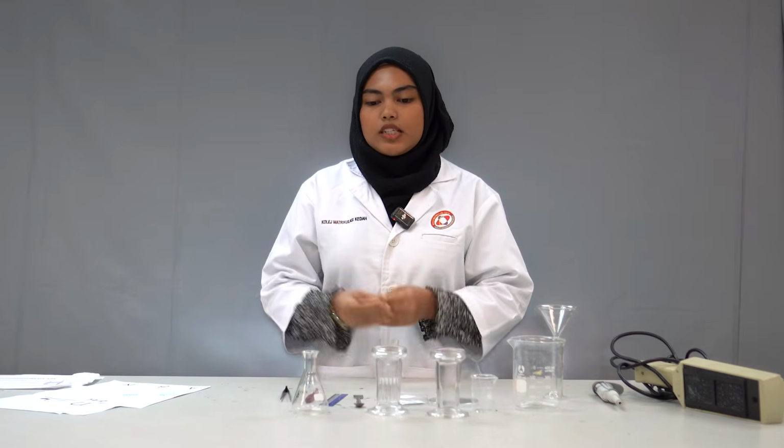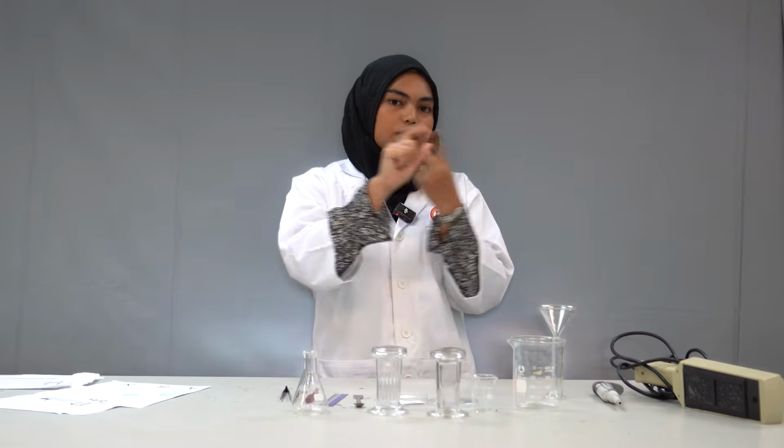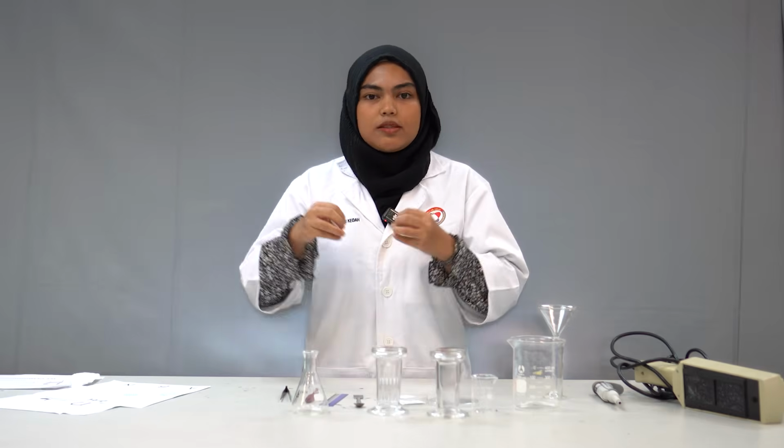Okay, next I will talk about the industrial applications of the TLC experiment. There are three largest fields that use TLC, which are clinical, pharmaceutical, and food testing. As we know, TLC is cheap, fast, and simple, so we don't need to automate it. We just need to do it manually.